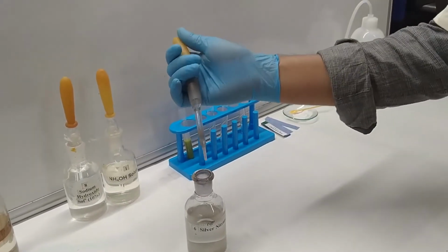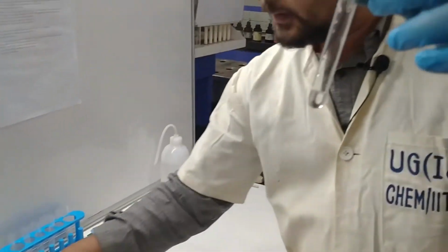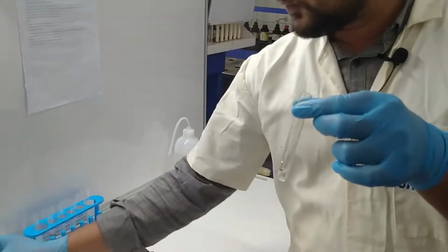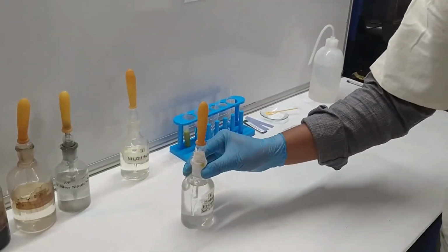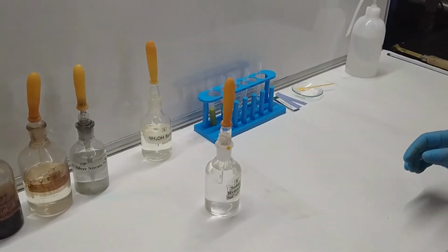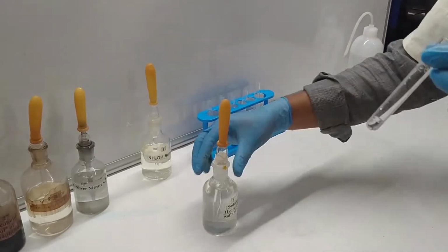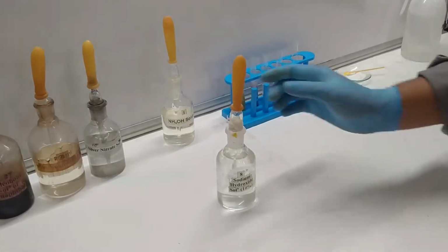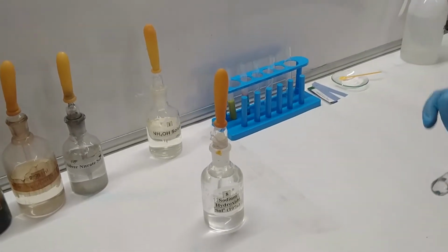This is approximately 1 ml. Okay, so now here I am going to add some drops of the sodium hydroxide, and after adding sodium hydroxide, see, this is the sodium hydroxide, this gives you a gray color precipitation.